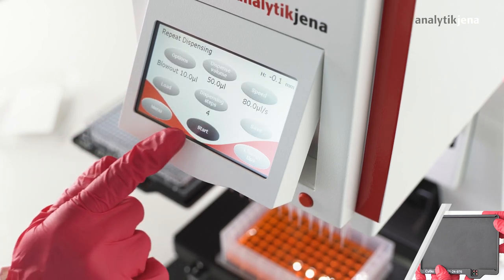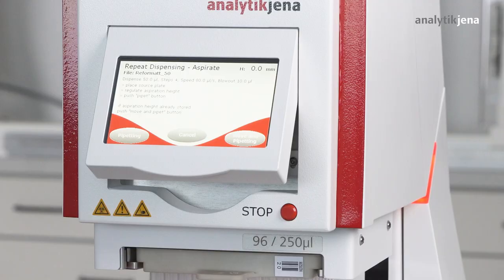The user confirms the settings with Start and is then guided step-by-step. The move and pipetting button must be pressed to start executing the method. The currently executed steps are displayed.